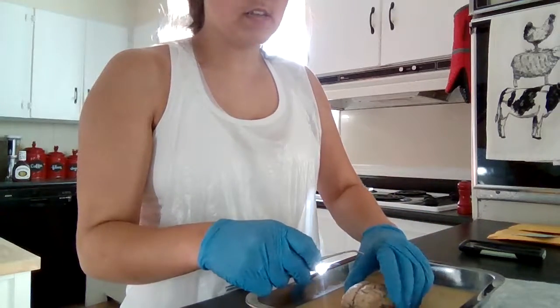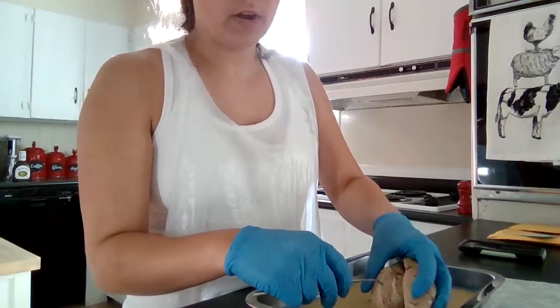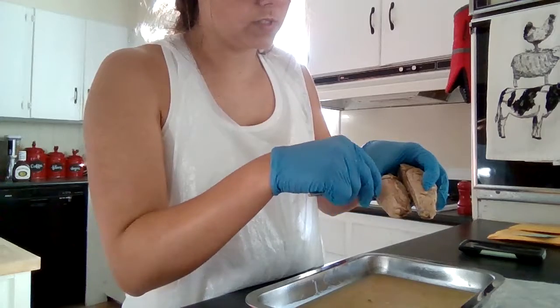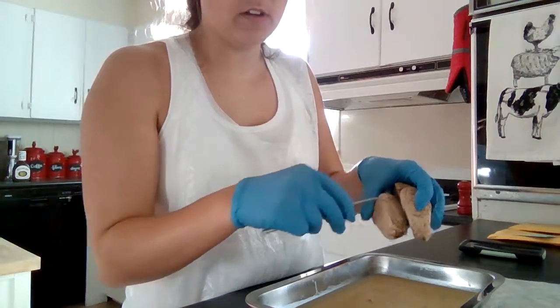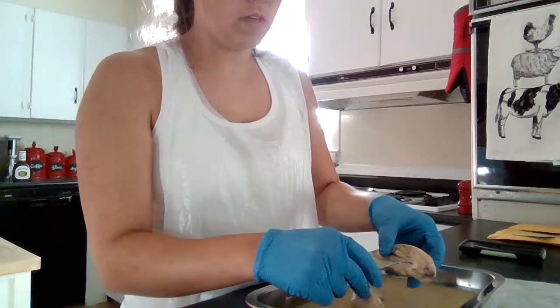The corpus callosum is in the middle. It's going to be this white part. I went ahead and split the brain in half, so it's kind of hard to see, but it's the white part that was holding the two halves together. The thalamus is going to be right here.